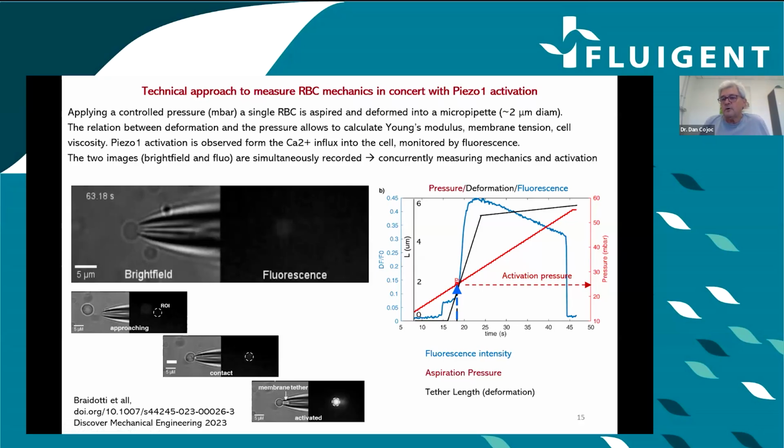So first there is a contact, and then we have a higher pressure and activation of the channel.